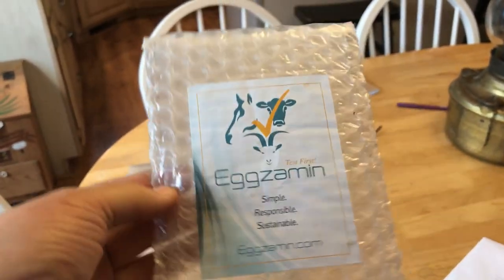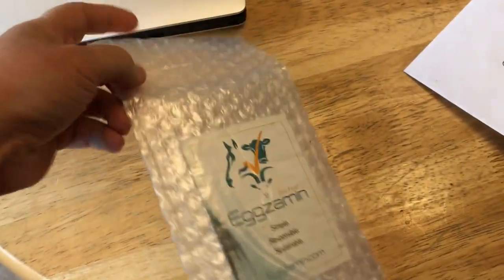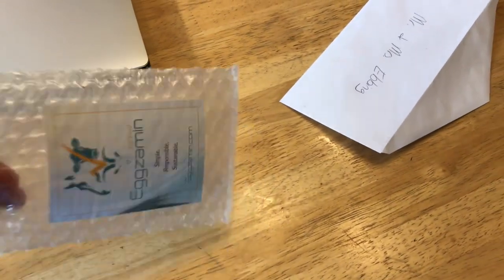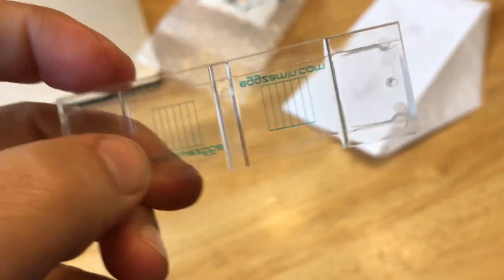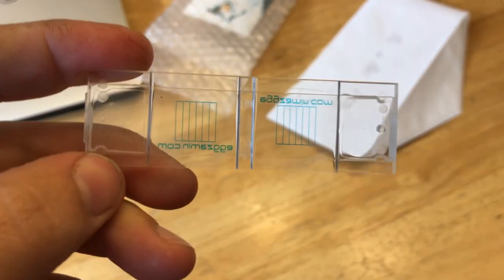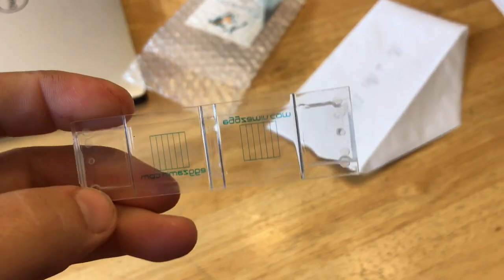The slide is in this package. I keep it in here because these are not cheap, but what I do is I just clean it really well after each use, let it dry, and then I put it back into the bubble pouch. These are about $20, and if you look, you see how they've got the lines on them? So when you're looking at it under the microscope, it actually divides it up into increments, so you can count in each column how many of what parasite or eggs you're looking at, and that gives you an idea of the load that your animal is carrying.